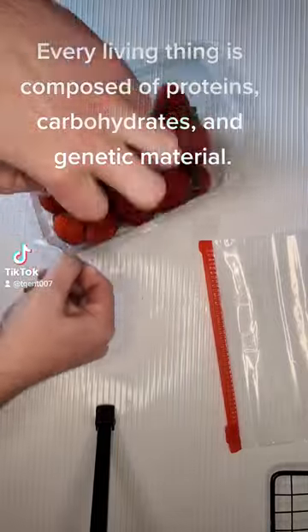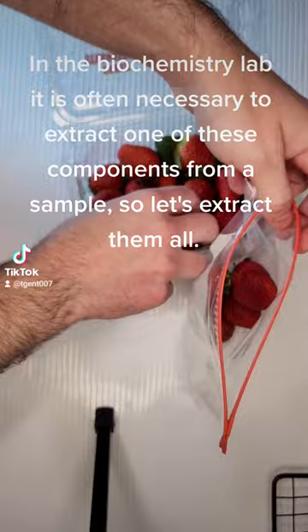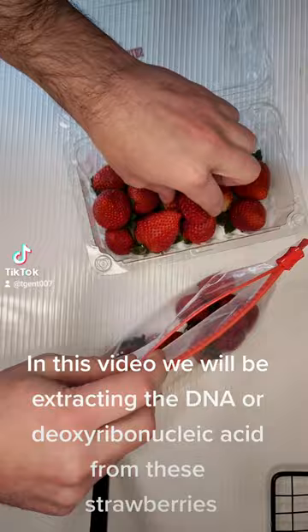Every living thing is composed of proteins, carbohydrates, and genetic material. In the biochemistry lab, it is often necessary to extract one of these components from a sample, so let's extract them all. In this video, we will be extracting the DNA, or deoxyribonucleic acid, from these strawberries.